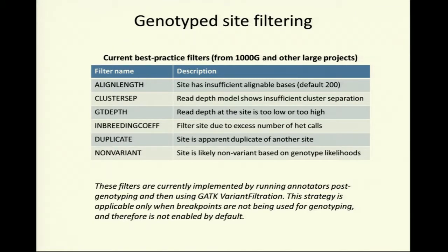And finally, if you give Genome STRiP two sites that overlap, Genome STRiP will look at the posterior likelihoods and try to decide whether these were duplicate calls of the same event. This was used a lot in 1,000 genomes where we were integrating calls from multiple callers. We used the posterior likelihoods in the genotyping in Genome STRiP in phase 1 of 1,000 genomes to try to get rid of duplicate calls that were made by different callers but with slightly different boundaries.